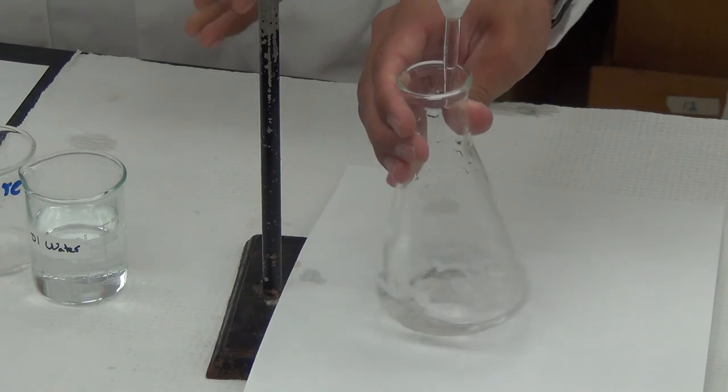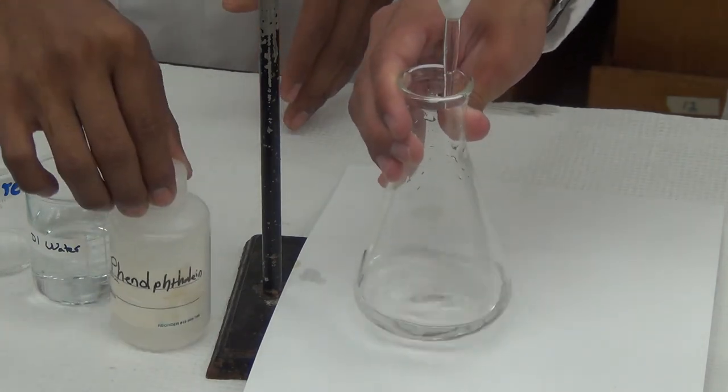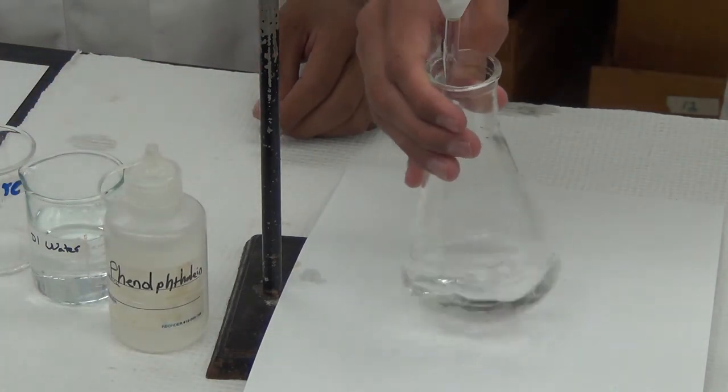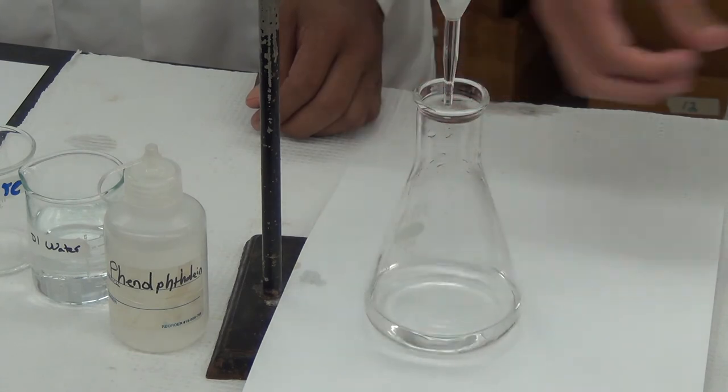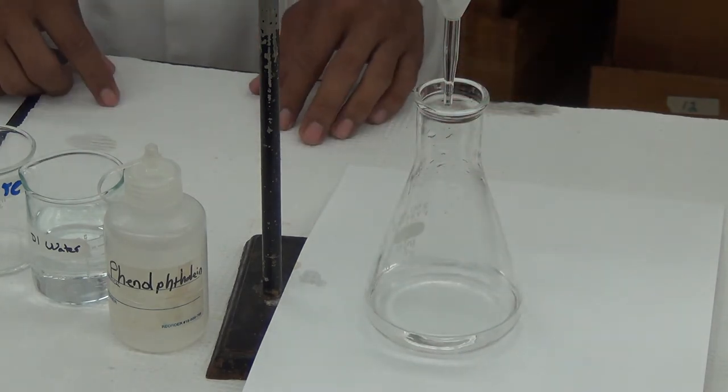We will be finding the volume of titrant it takes to neutralize the acid in the vinegar. The phenolphthalein is an indicator. It will show us when we've reached the endpoint of the titration by changing color.